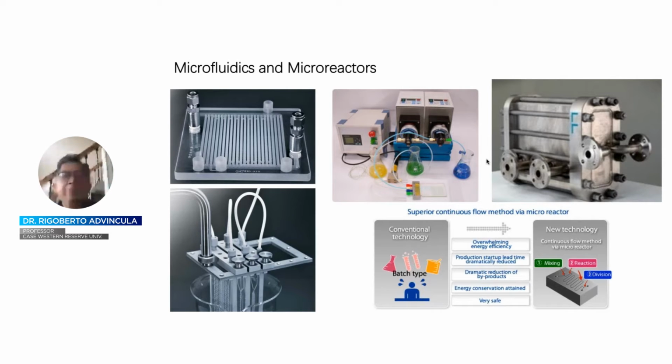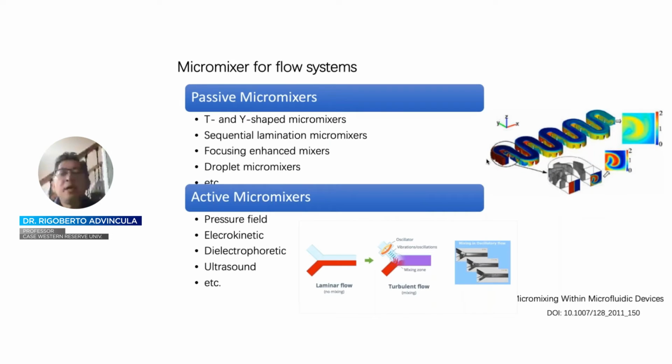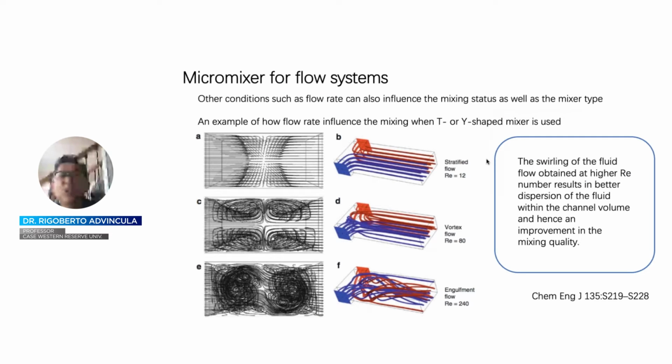And as I said, this is a growing field in the area of materials or polymer synthesis because of that controlled environment. In fact, it relies a lot on control of mixing, either the use of passive or active micromixers, for example, in microfluidics, which has been well studied to affect the kinetics of a reaction. So modeling, including AI, is ripe for optimizing such flow conditions, and the investigation of flow chemistry can focus in this area, which includes the design of new devices, microfluidic systems, or chemistries that can be done under flow conditions.